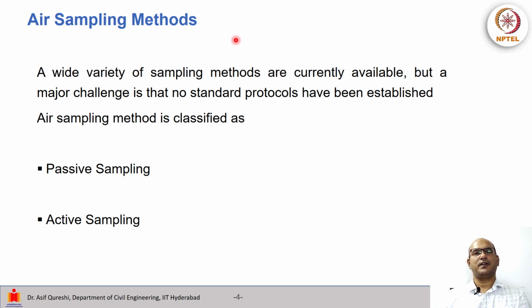So since we have such a wide variety of aerosols, we also have a wide variety of sampling methods. A wide variety of these methods are available, but there is a bit of a challenge because for many of them the standard protocols are still being established.